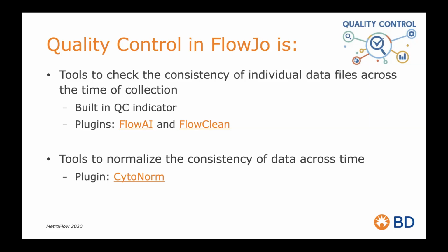These differences in brightness could, again, just be attributed to differences in a machine over time, or even just different cytometers running that have different setups. And so we'd like to make sure, again, that when we're doing comparison, the differences are due to some kind of biological phenomena and not just machine setup. So let's talk about those tools.